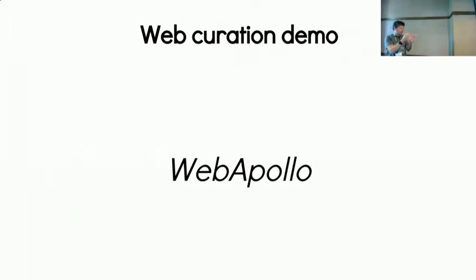So it's useful as you have a lot of BAM data coming in. I'm trying to think if there's anything. As you can see, the annotations are listed. Trying to see if we have one that has multiple scaffolds on it. Also, that little exclamation point inside the circle means you have a non-canonical splice site there. So if it's not the normal acceptor or donor site, it gives you a little symbol that says this is weird.